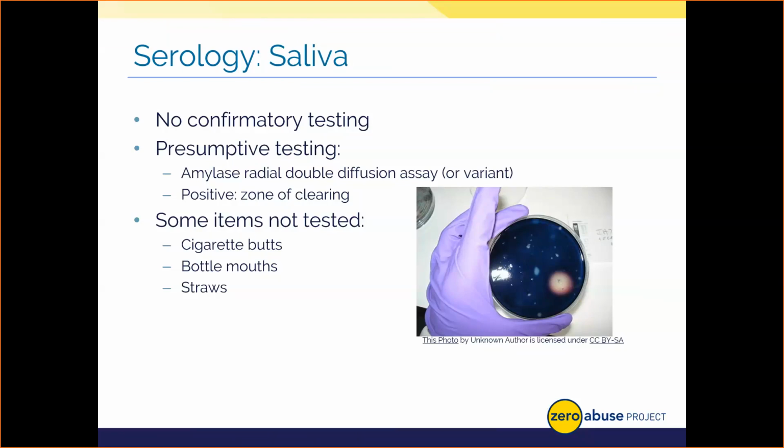Just very quickly to tell you about it, it's simply using this proprietary reagent, and when you incubate it with a sample suspected of amylase within 30 minutes at 37 degrees Celsius in that incubator, you should get a positive reaction that's a shade of blue.